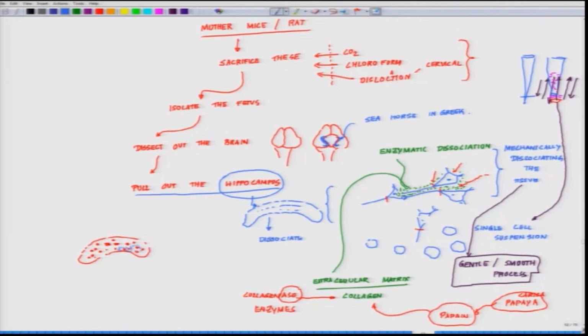It infiltrates into these zones, and the job it does is to weaken the adhering forces between the cells.